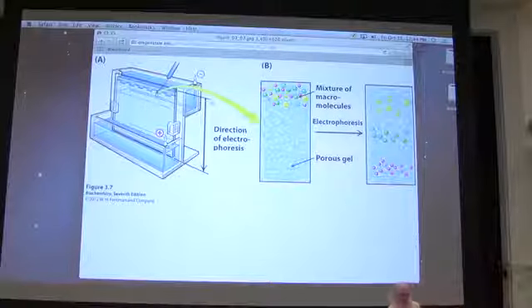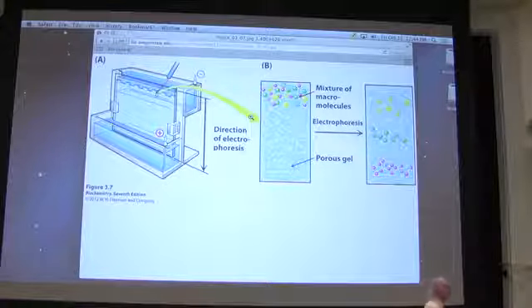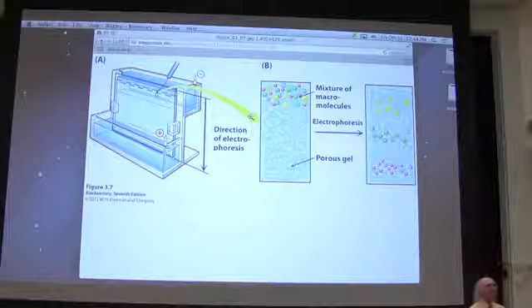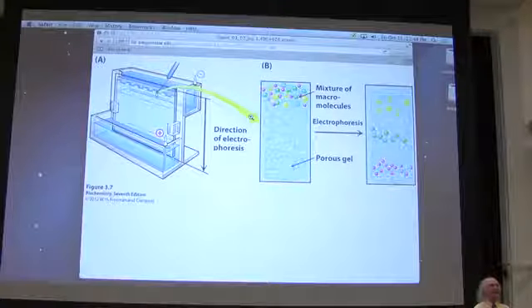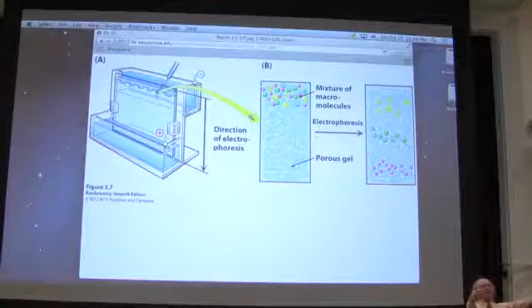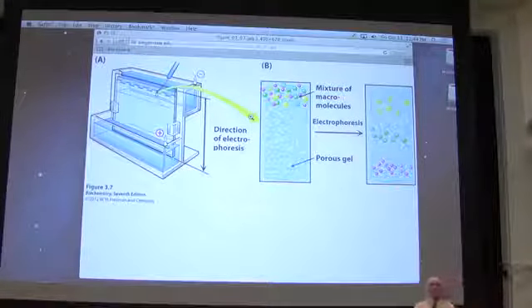Okay. Yeah, question. Where you at? SDS denatures the protein. That's the key to the way it works. Yes. Well, you wouldn't use SDS to purify it. You wouldn't use the SDS PAGE to purify it. You would use SDS PAGE to analyze it, but it's not going to be a purification. Okay? Good question, though.